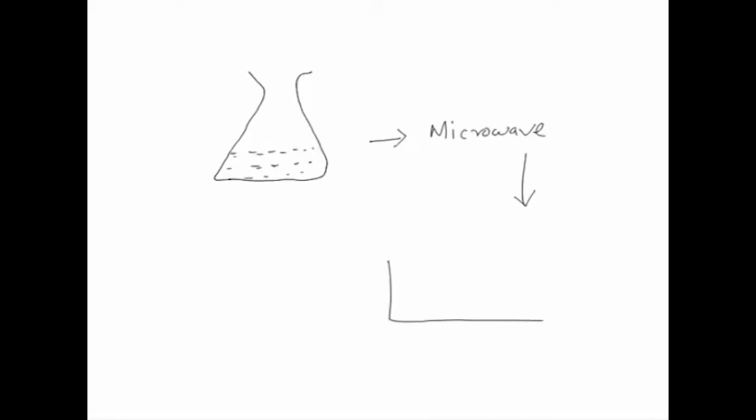Now, you will have a gel apparatus. This gel apparatus is enclosed from two sides, it is a glass strip with two enclosed sides, and the other sides you can tape. When you tape it from both sides, it will be enclosed from all sides. Now you can pour this material in, using a glass rod, or very carefully from the sides. This will distribute evenly onto the gelling apparatus.